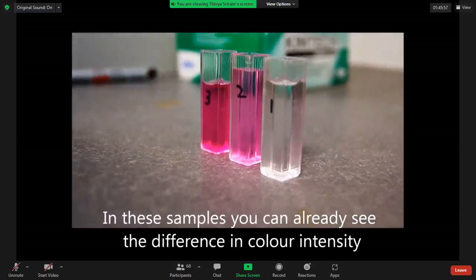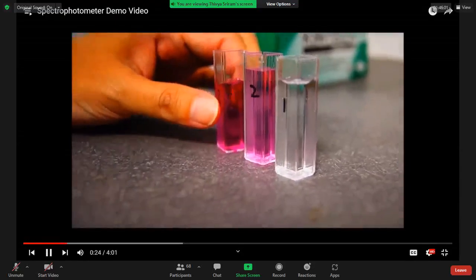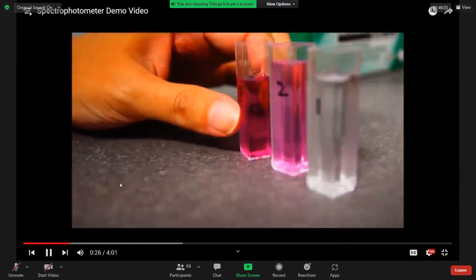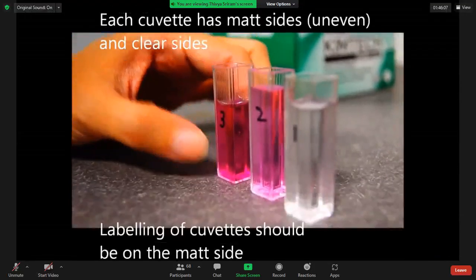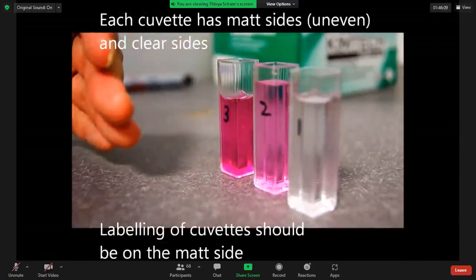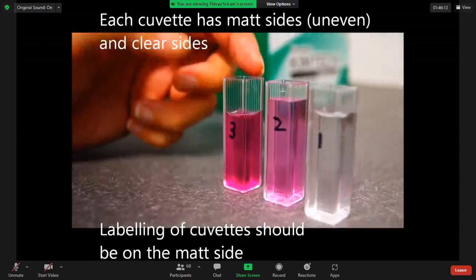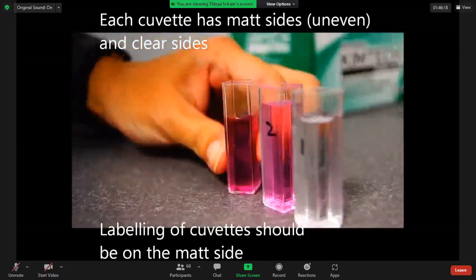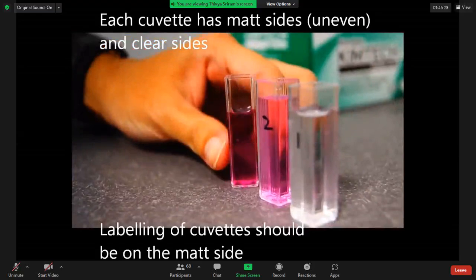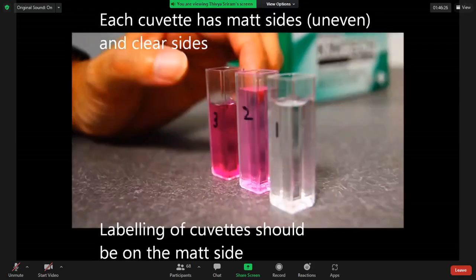What's important about this is that I want you to see the difference in the sides of the plastic cuvette. You can see the part that is facing towards the front, and the front and the back, is actually a matte surface, that means it's a little bit uneven, whereas the surface at the side of the cuvette is clear. So that will come in important when we put the cuvettes in.